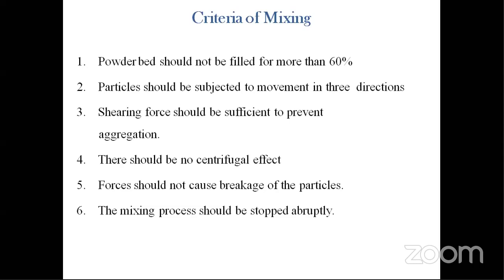They cannot move freely between the powder and the vessel. So you have to put a maximum of 60% in the vessel or the powder bed of the equipment.